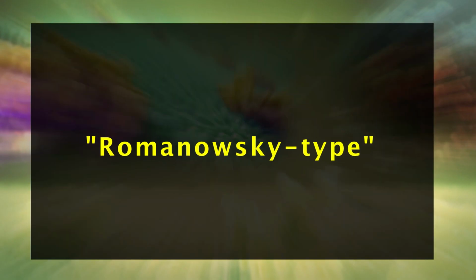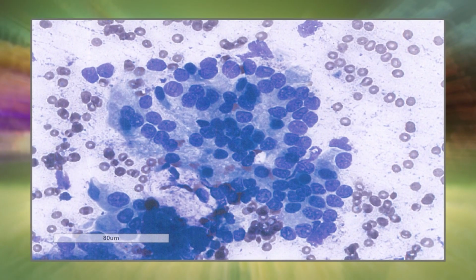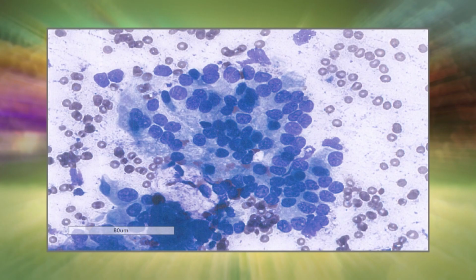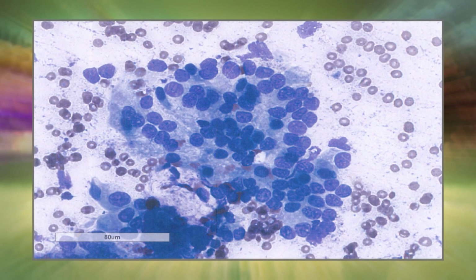There are a variety of Romanowsky type stains with a mixture of methylene blue, azure and eosin compounds. Among these are the Giemsa stains and the Wright stain, or Wright's Giemsa stain. The latter is utilized to stain peripheral blood smears. Number 5 is Gram staining. This is one of the most common staining techniques. It is largely used to differentiate bacteria species as either gram-positive or gram-negative.